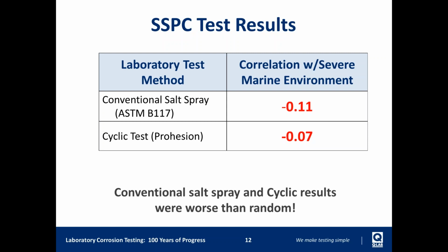And so what this shows us is that when comparing outdoor results to these test methods, it was effectively random. These did not give any kind of good correlation and could not be used to identify whether a material is going to perform well outdoors or not.